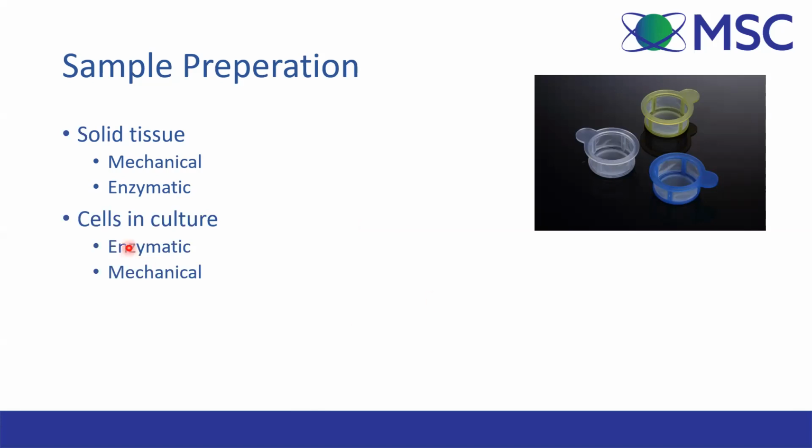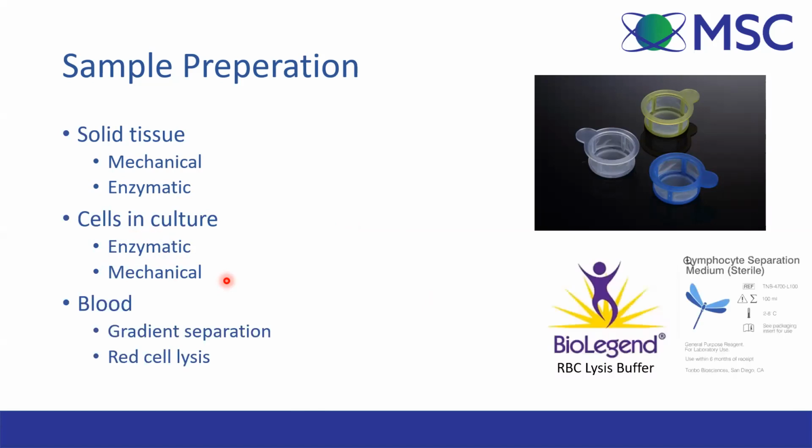Cultured cells are most commonly removed from their flasks enzymatically using trypsin or Accutase. But sometimes people will scrape cells off, use EDTA or other mechanical means. All methods can cause some cell death. You need to be careful, and the most important thing is you need to be consistent with your method.